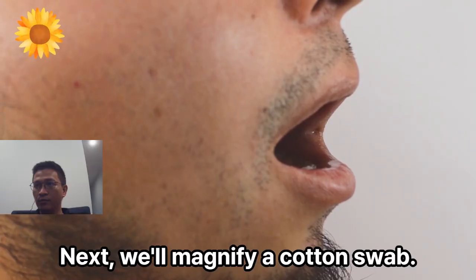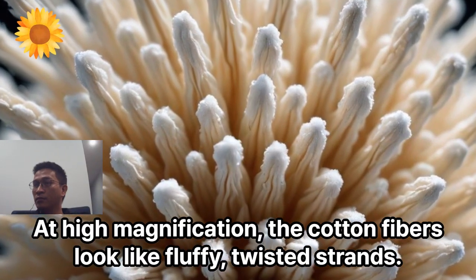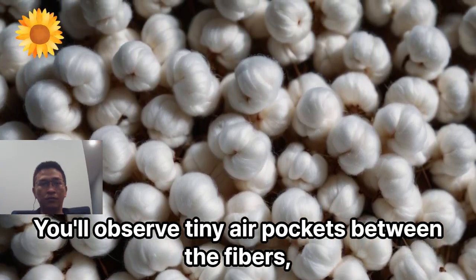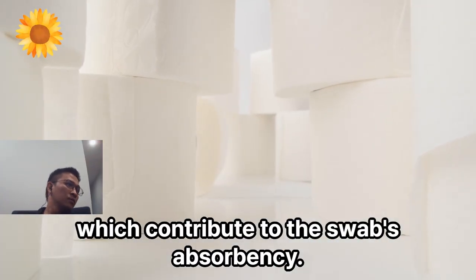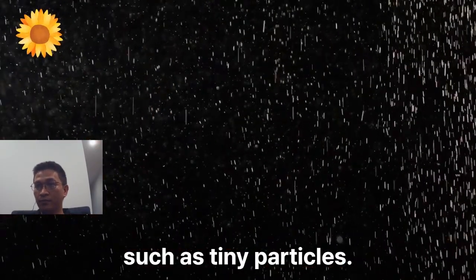Next, we'll magnify a cotton swab. At high magnification, the cotton fibers look like fluffy, twisted strands. You'll observe tiny air pockets between the fibers, which contribute to the swab's absorbency. You might even spot remnants of the manufacturing process, such as tiny particles.